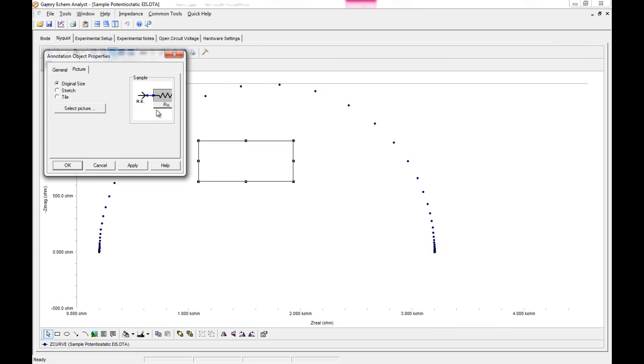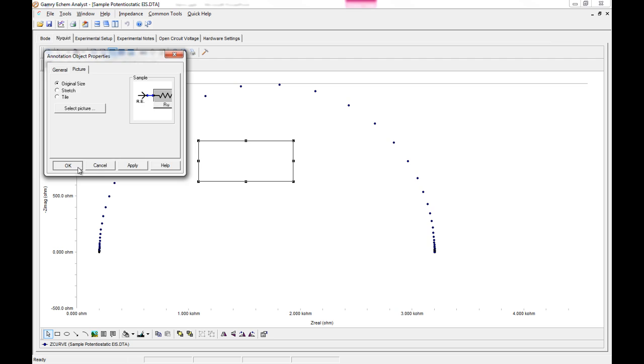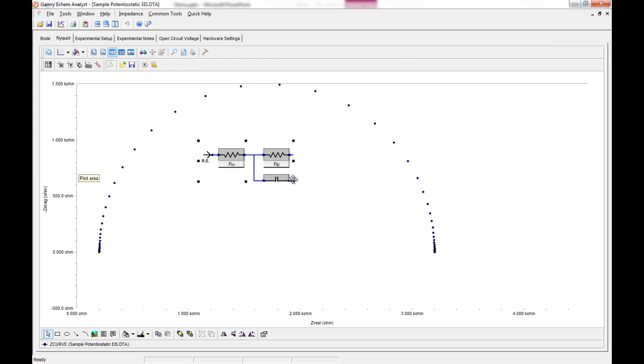In my instance, I'm going to show the Randall's picture. And you can send it to the original size. You can stretch it to fill the box that you already have drawn. Or you can tile it if your image is smaller than the box you've already drawn. So I'm just going to leave it at original size. Click OK. And we can see it loaded up.